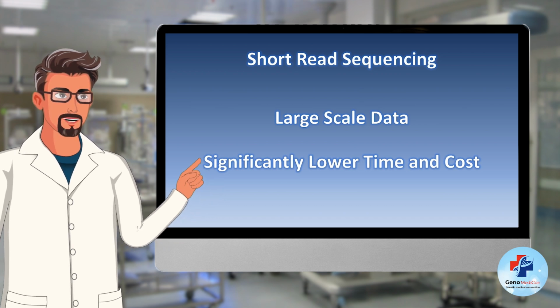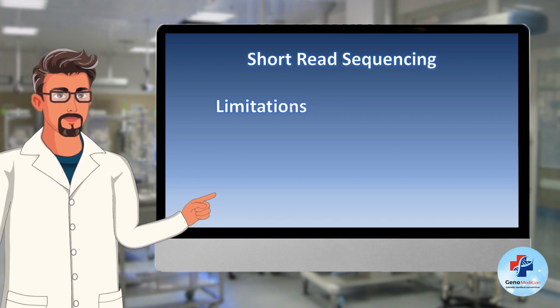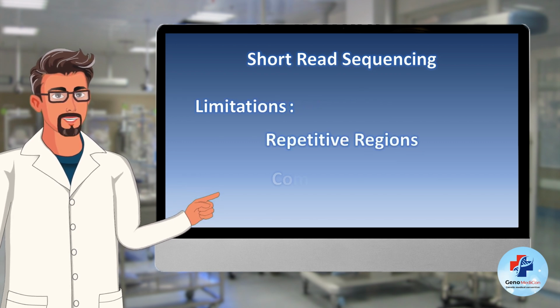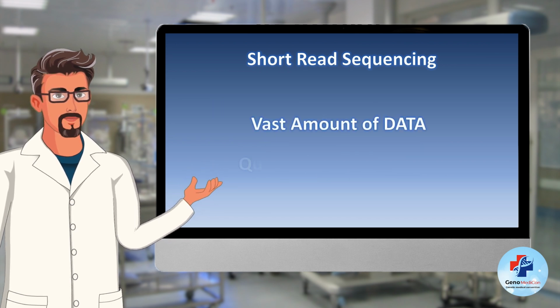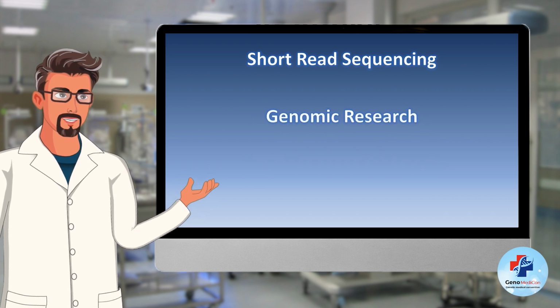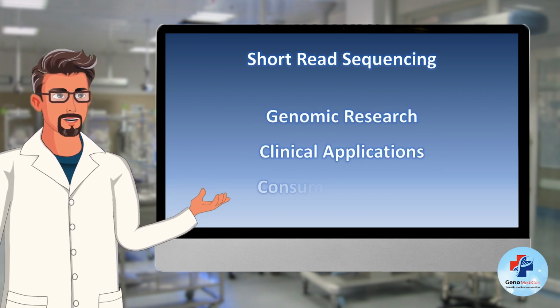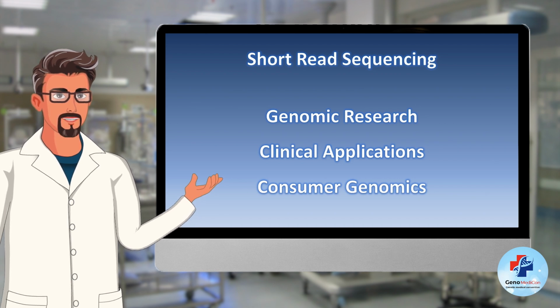Despite its widespread use, short-read sequencing does have limitations, particularly when analyzing repetitive or structurally complex regions of the genome. However, its ability to produce vast amounts of data quickly and cost-effectively ensures its place in genomic research, clinical applications, and even consumer genomics.